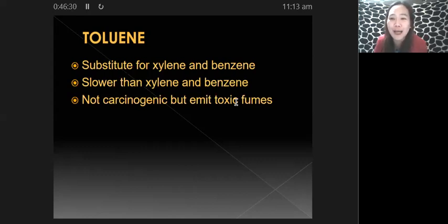I might put it in your exam or in your quiz later on, so be careful. We only have xylol and toluol, but no benzool, no benzol.